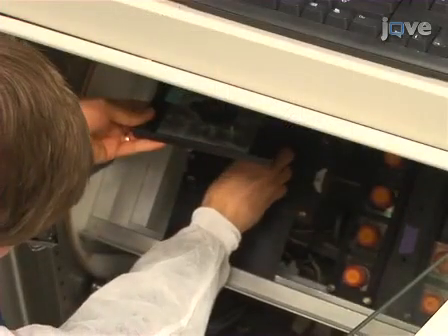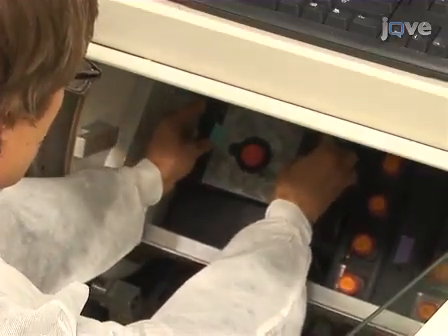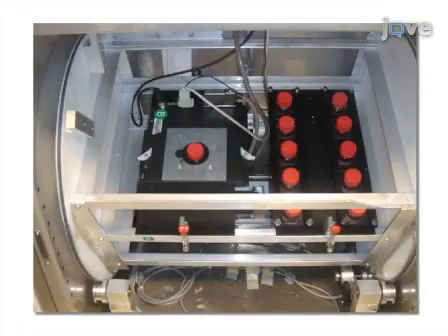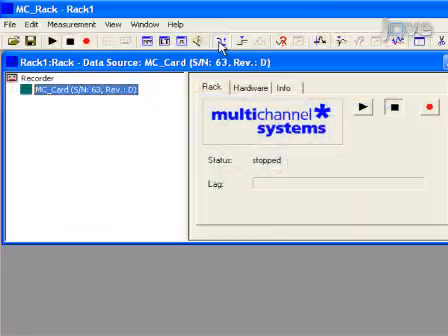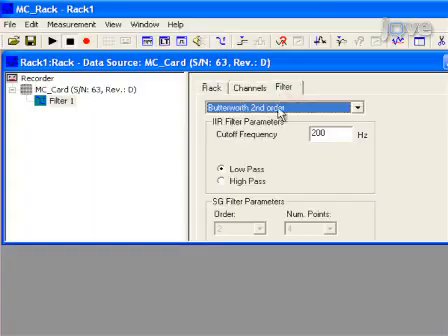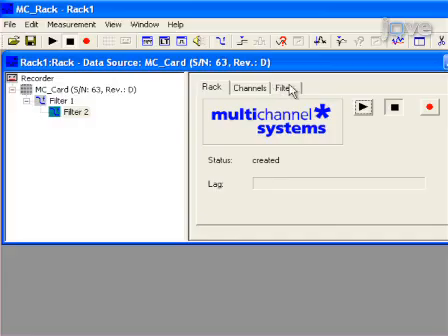To begin a recording session, the MEA is transferred from the storage tray to the recording head stage. To record local field potential, or LFP, use a bandpass filter of 1 to 200 Hz. Multi-unit activity can also be studied using a bandpass filter of 300 to 3000 Hz.